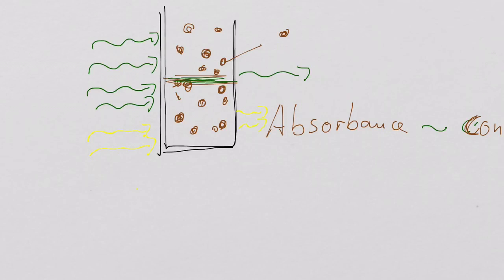Why? Because it doesn't have the right energy to hit the electrons of my little red blobs. Exactly. So we need to be exactly in the right wavelength for something to happen.